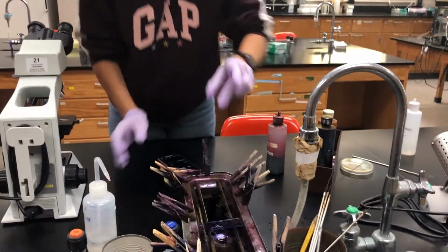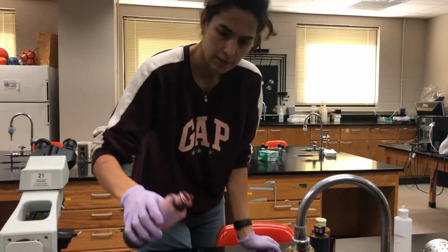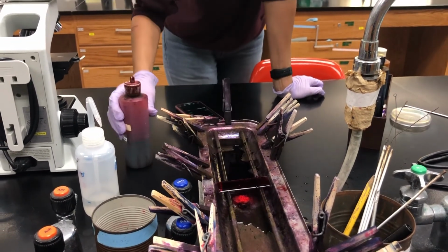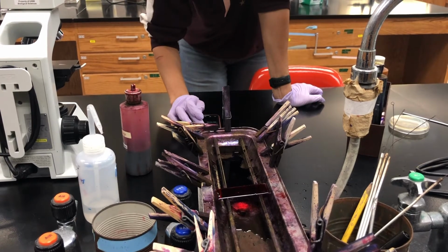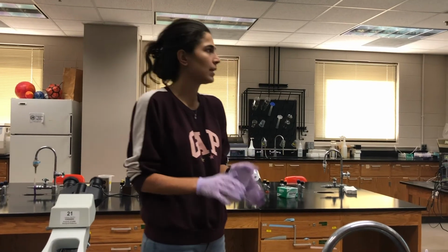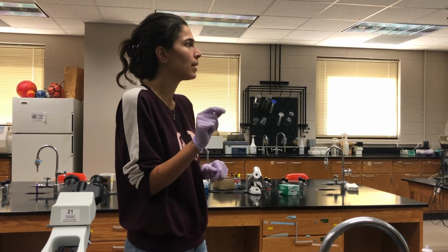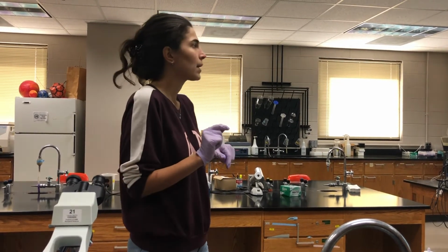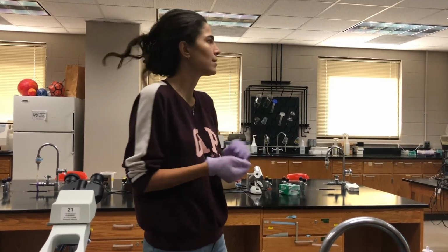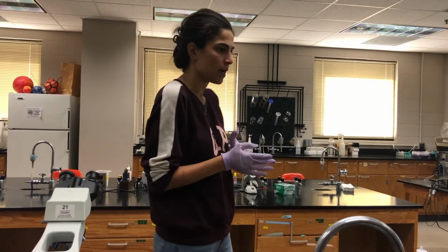Okay. This time we need to add safranin. Here is the safranin. Okay. We need to wait for 1 minute. Okay. So after we add the safranin and wait for 1 minute, we need to rinse it with water. But after that, we need to do the blot dry. Don't wipe, because we wanted to keep the smear. We don't want to just lose it. So we need to see the objectives under the microscope.